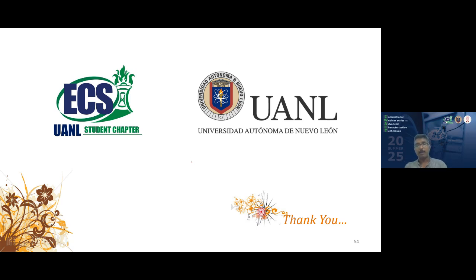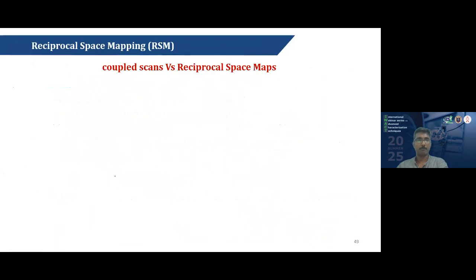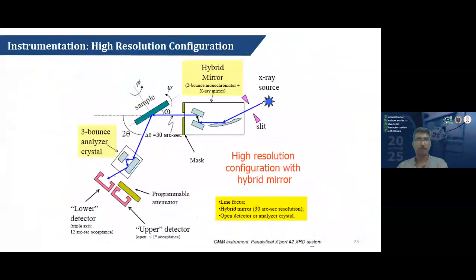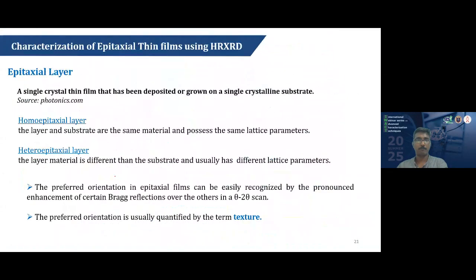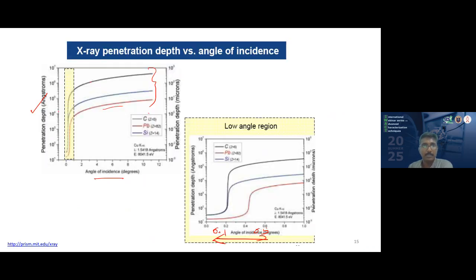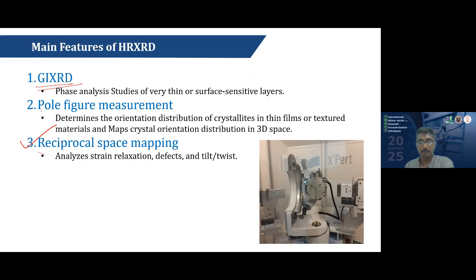Oh, okay. See, in this case, with the sample direction and the normal direction, what we actually measure is the detector angle.